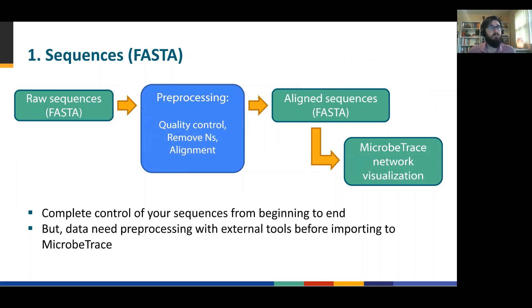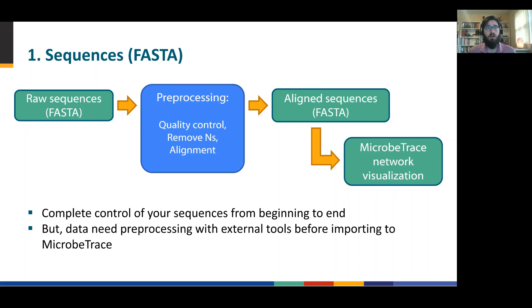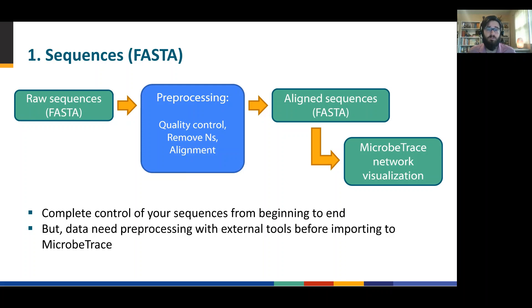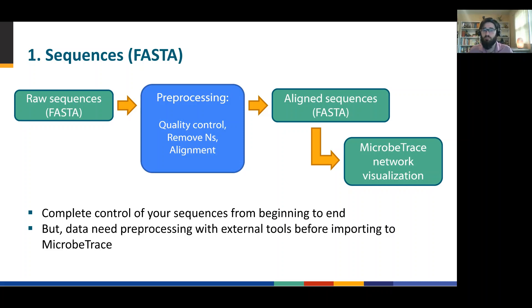The sequences often come in a raw sequence format in a FASTA file. And there needs to be some level of pre-processing and quality control to make sure that we're getting valuable comparisons. We'll walk through a few of what those pre-processing steps might be. Once you have the aligned sequence file, you can import that right into microbe trace and we'll visualize it for you.